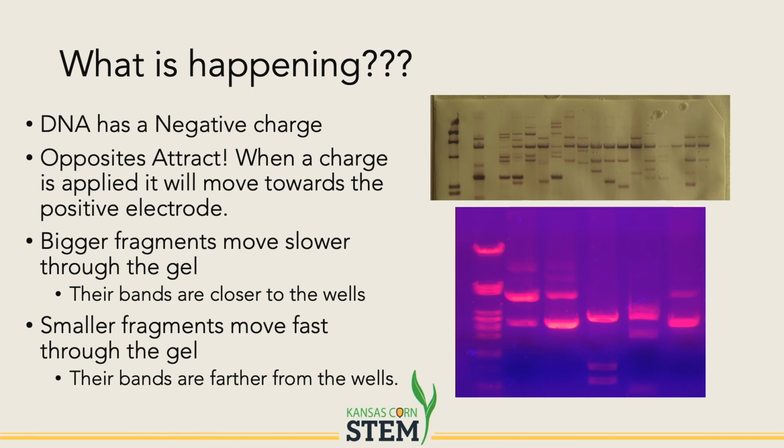So as you can see here, I have a couple of examples of other pictures of electrophoresis. The top being where the wells are, the bottom being the finish line. So the ones that are closest to the top of those pictures are going to be your biggest fragments of DNA. The ones that are farther away will be your shortest. And that's how we can compare our DNA, by looking at the bands.